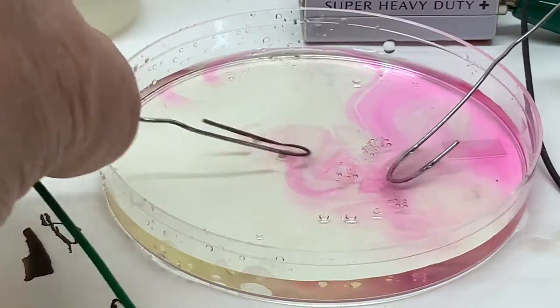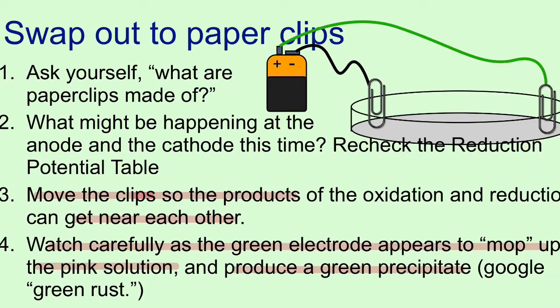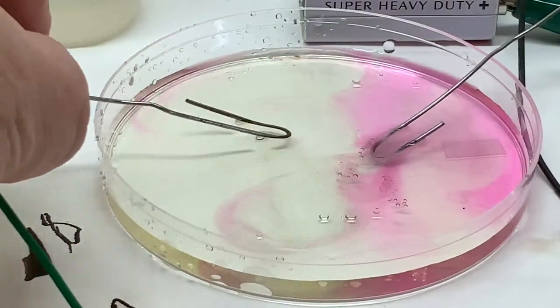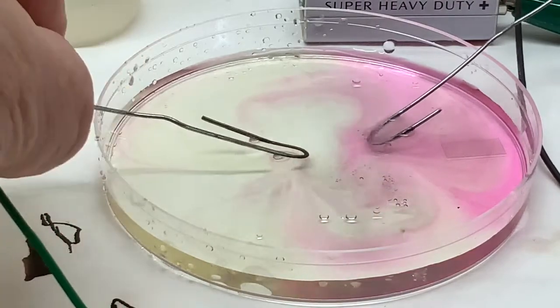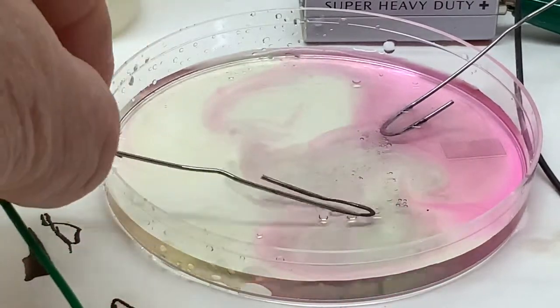This time the paper clips are moved around so that the products of the oxidation and reduction can get near each other. Did you notice that the green electrode paper clip appears to mop up the pink caused by the phenolphthalein?